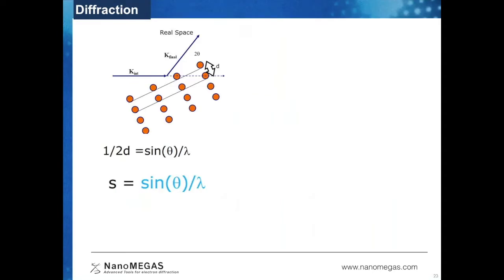Before I explain what the pair distribution function or PDF means, let's first see one of the most important terminologies which you will see in the PDF technique: Q, or the momentum transfer function. This simply can be derived by looking into Bragg's law of diffraction.